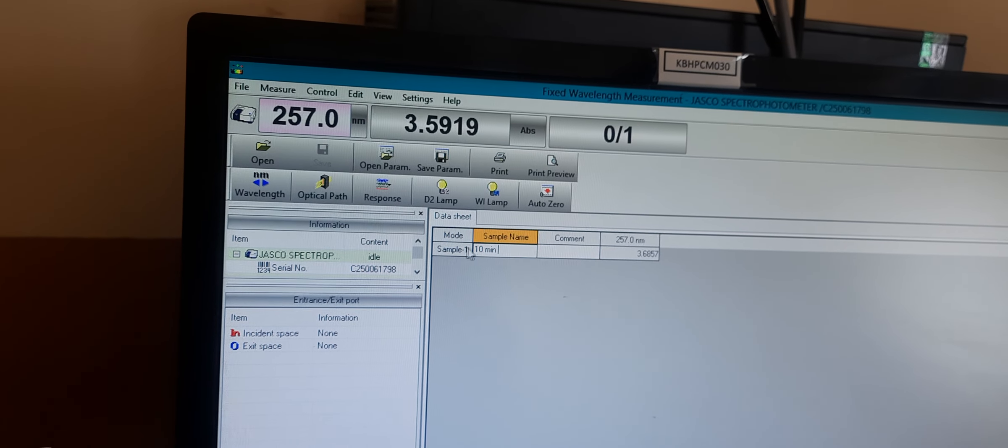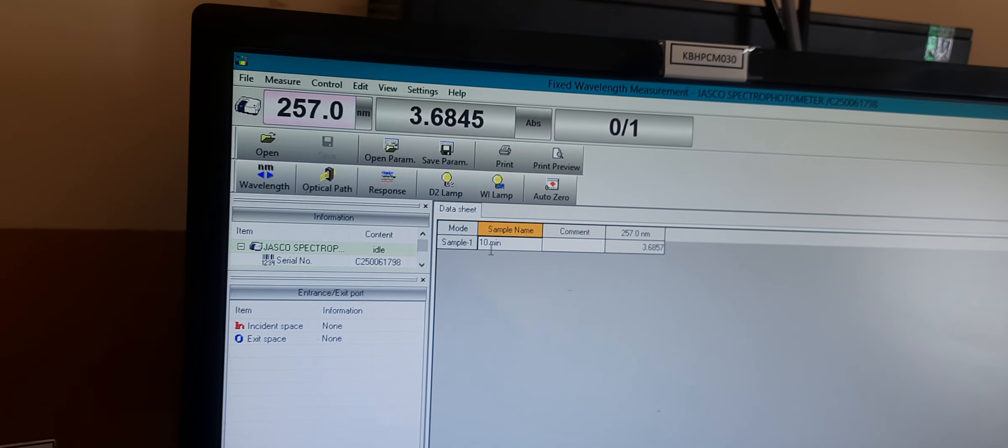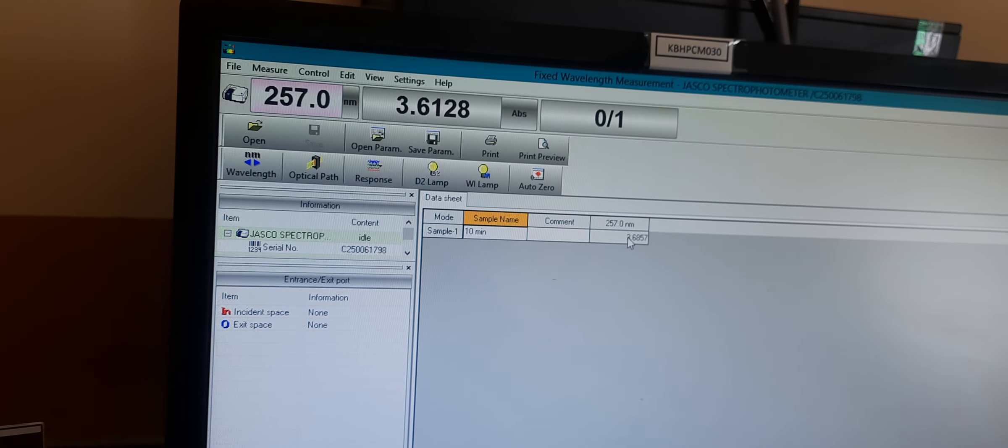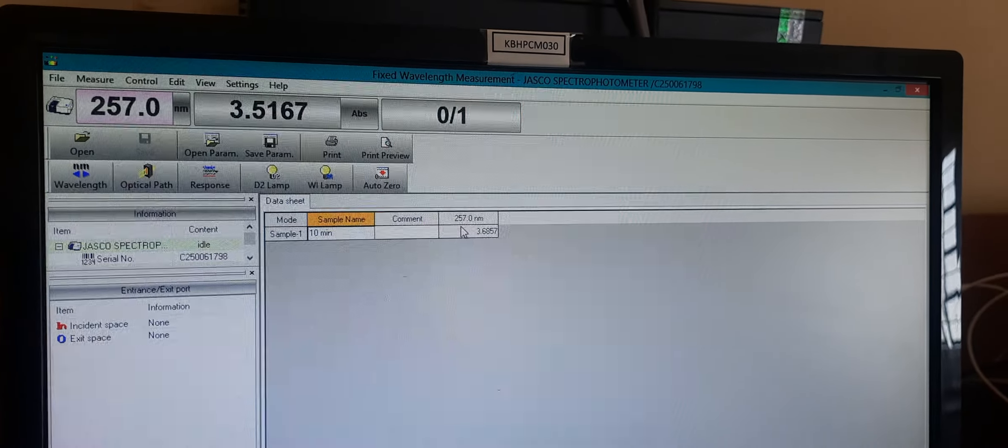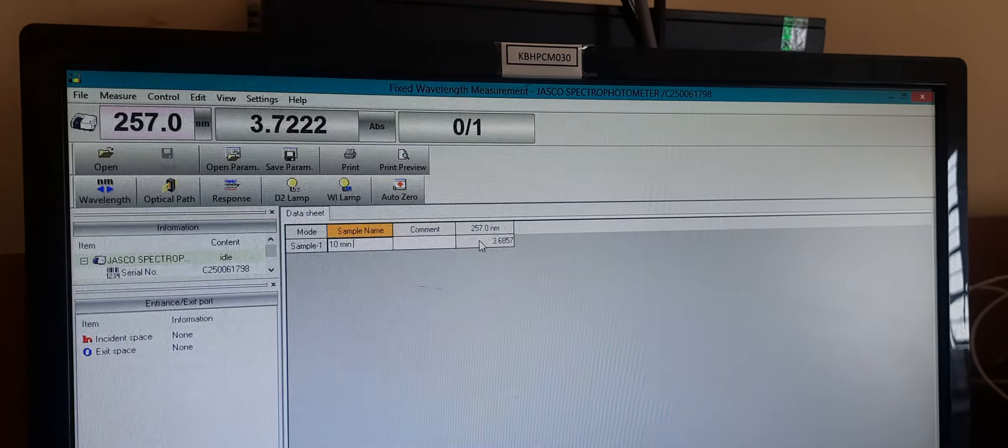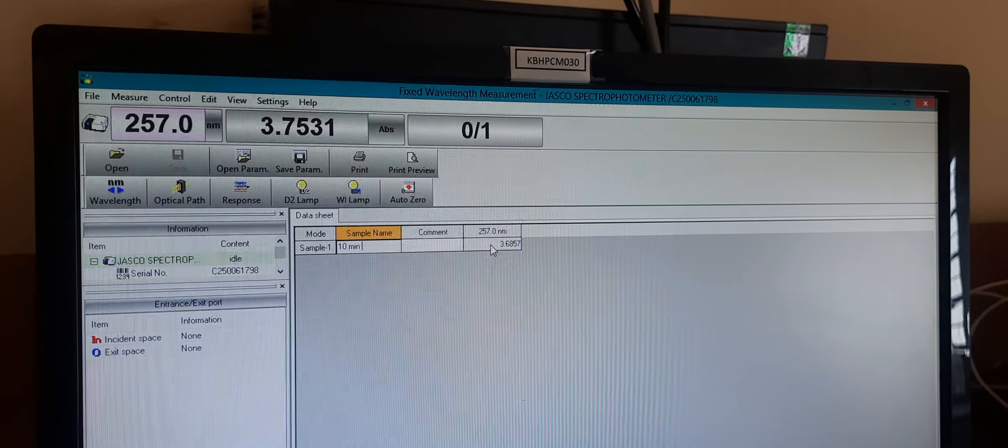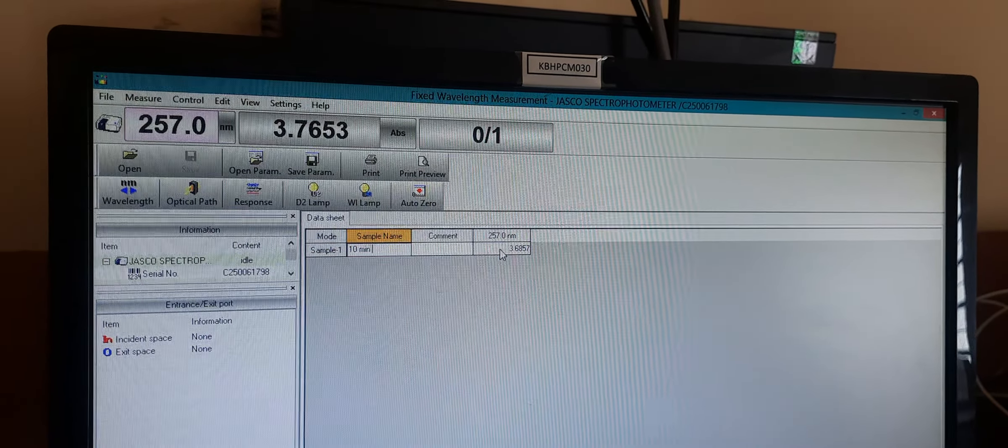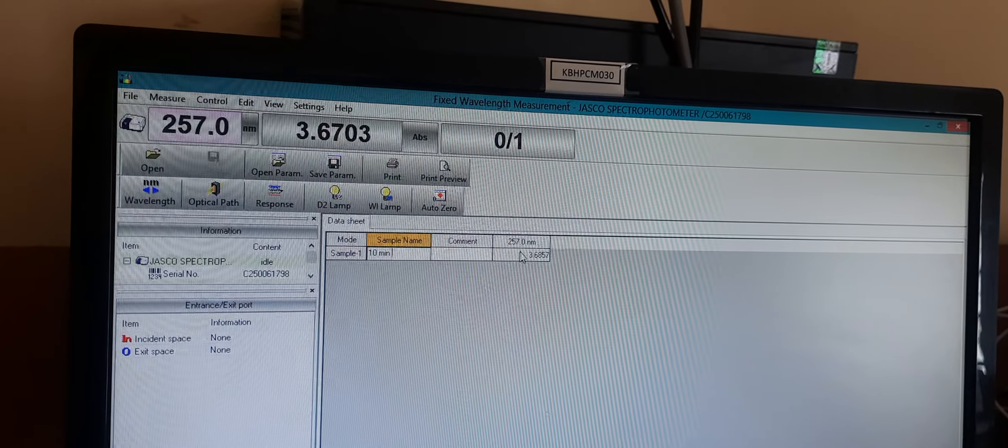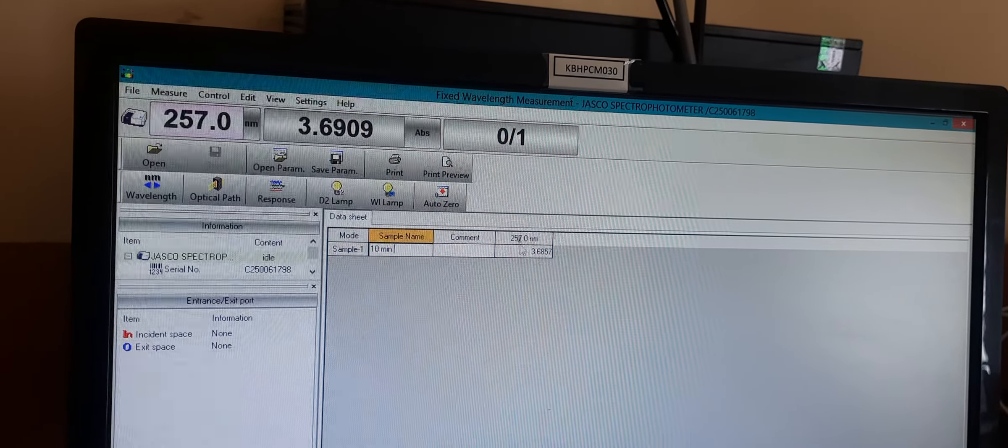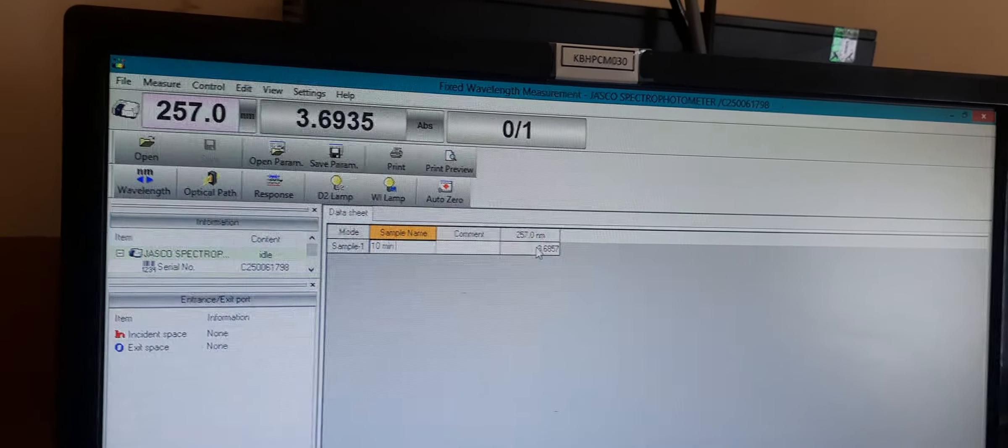Here we can see the absorbance of the paracetamol dissolution sample at 10 minutes. The wavelength is 257 nanometers and the absorbance is 3.68.